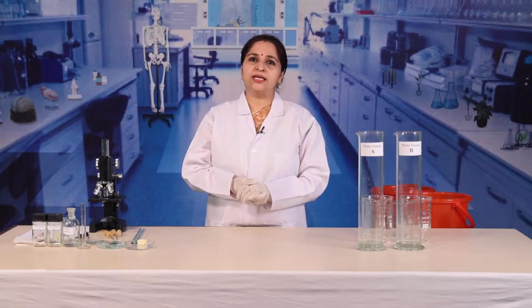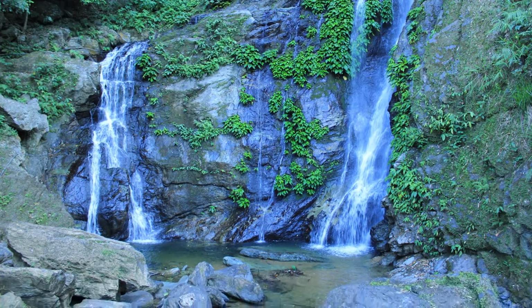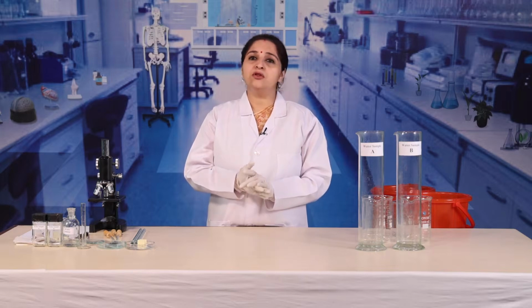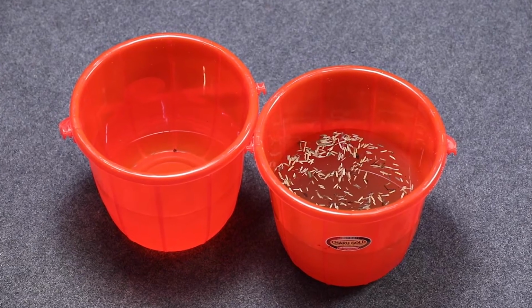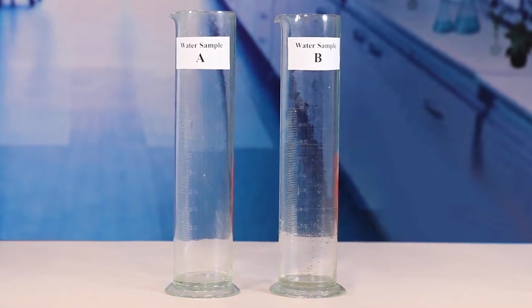First, you need to collect about a liter of water samples from nearby water bodies. Make sure that you perform this part of the procedure under the supervision of a teacher. Also, wear disposable gloves while collecting water samples. In the laboratory, transfer the water samples into separate measuring cylinders of 1 liter capacity.